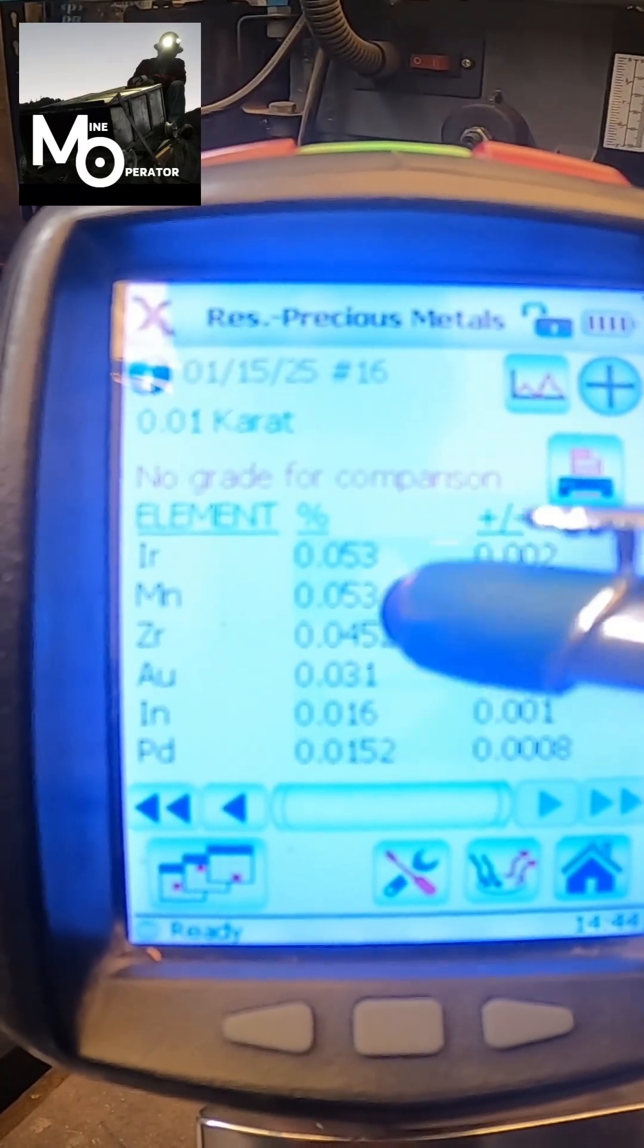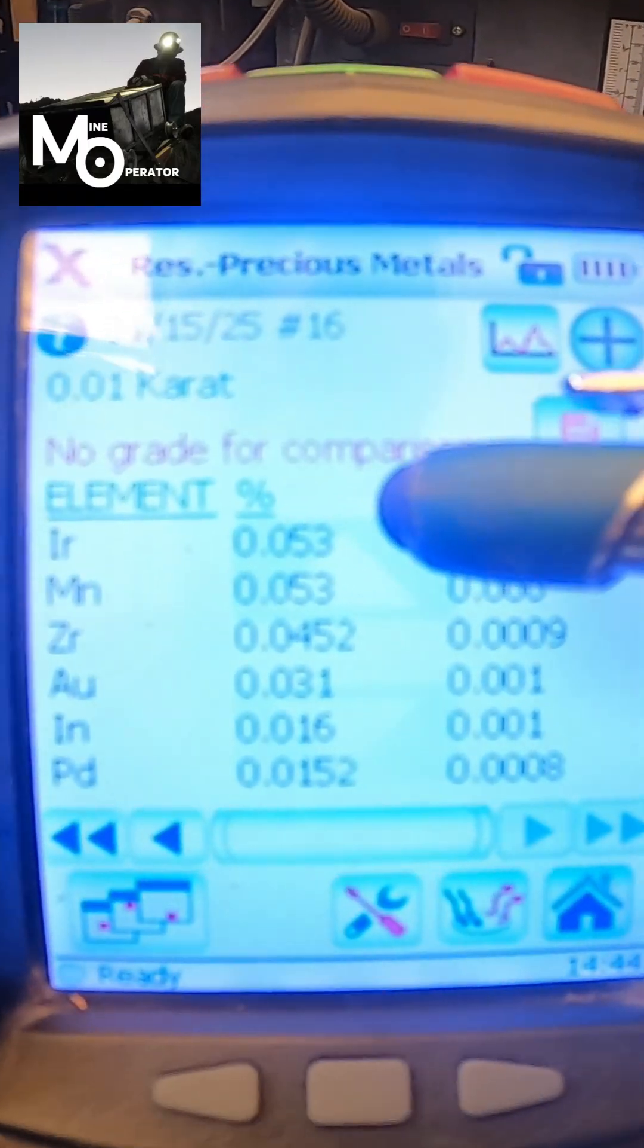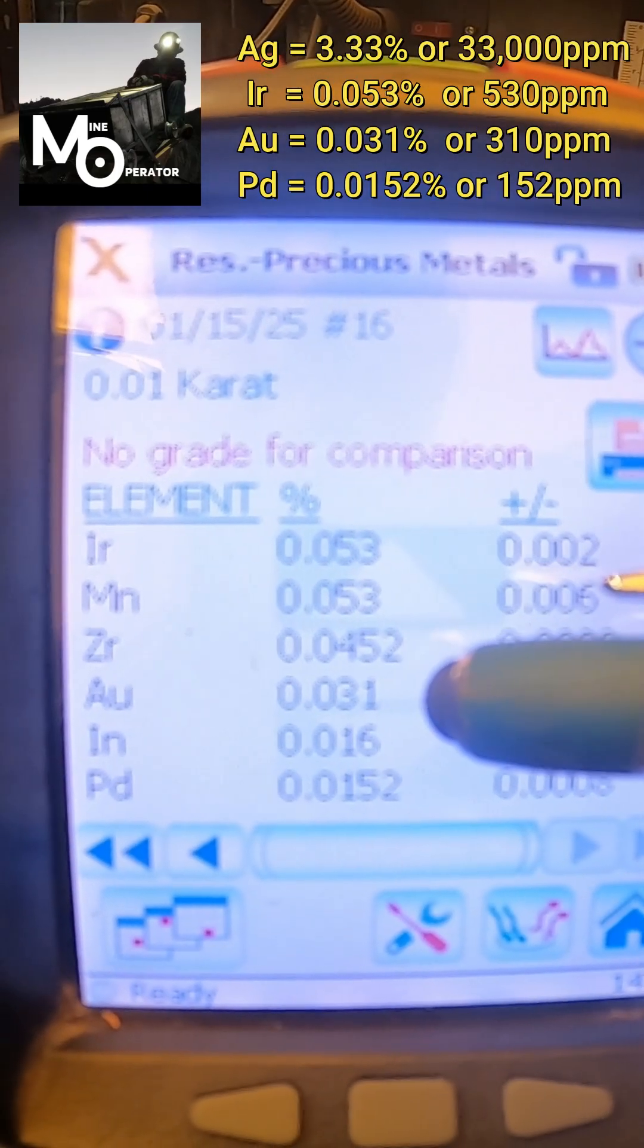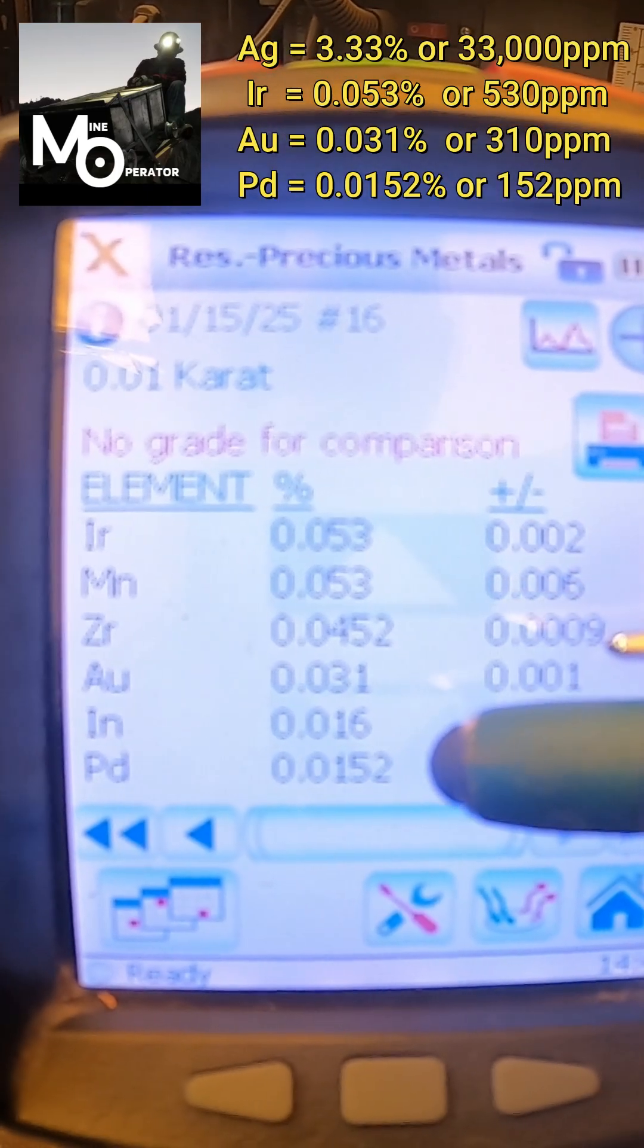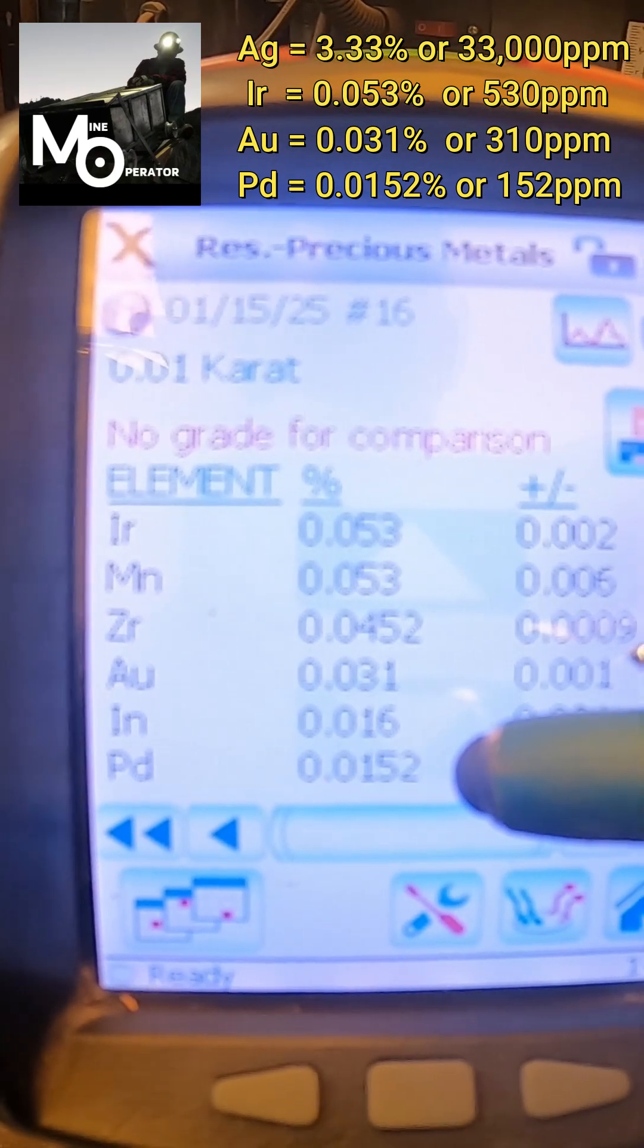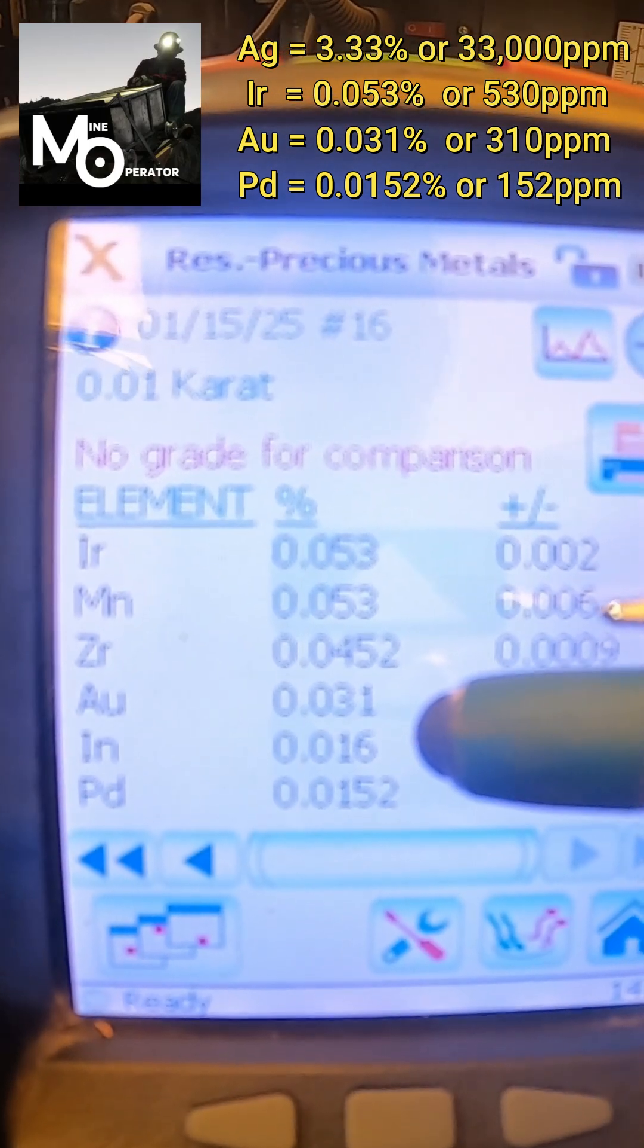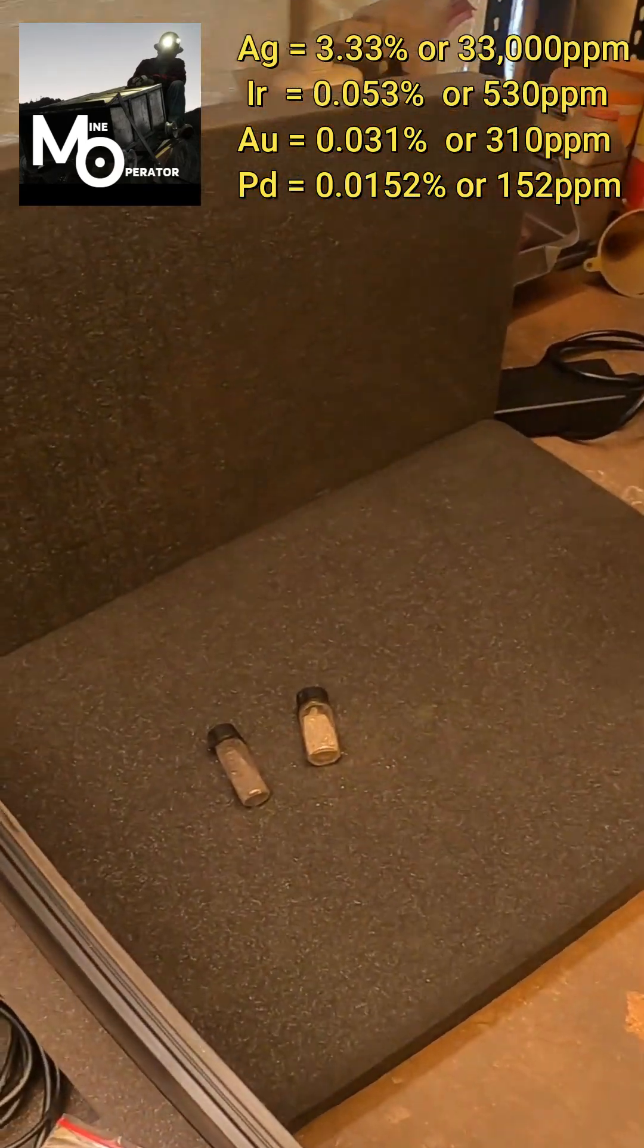Precious metals mode is calibrated to identify gold, silver, and all six of the platinum group elements. The XRF did identify silver, iridium, gold, and palladium in the sample. I have rarely seen these elements show up on the XRF, so Sean has some good ore to work with.